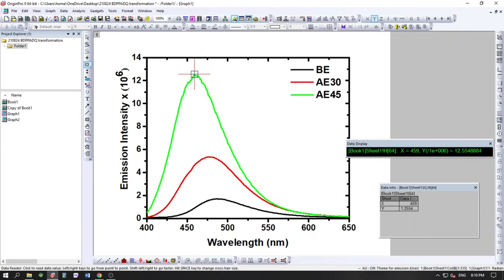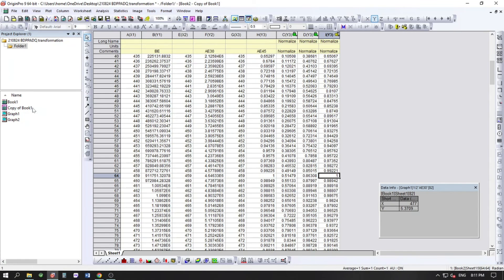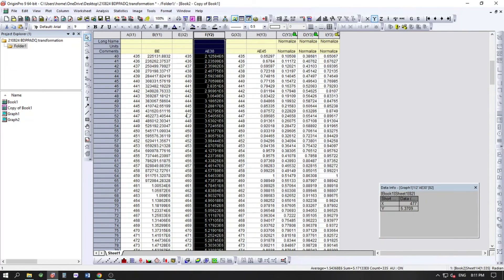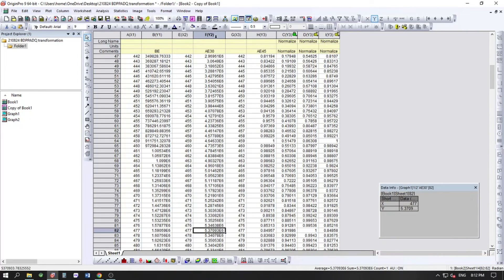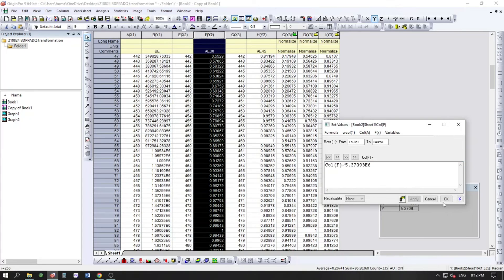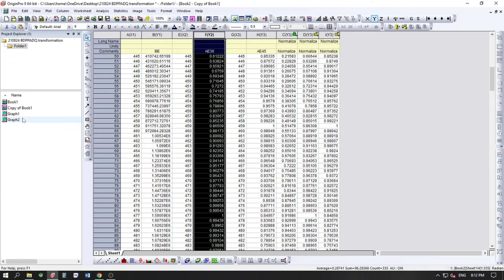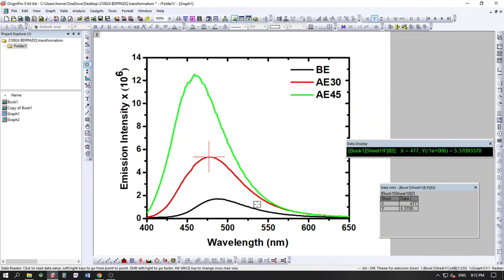For the second column, we identify the highest intensity value by scanning through. The maximum is 5.37 at 477 nm. Copy that value, go to Set Column Values, and enter: column F = column F divided by 5.37. Click Apply. Now the maximum value in that column is also 1.